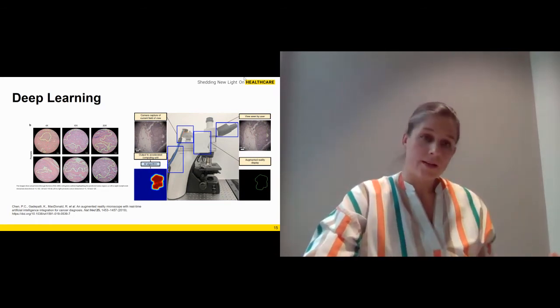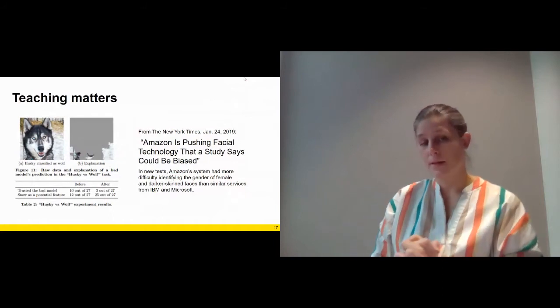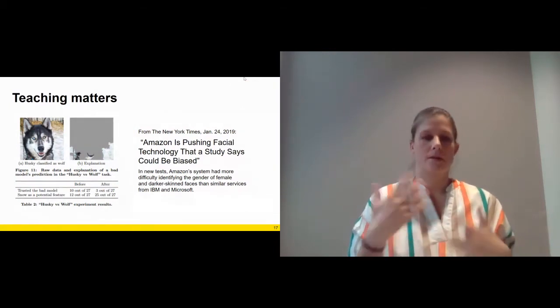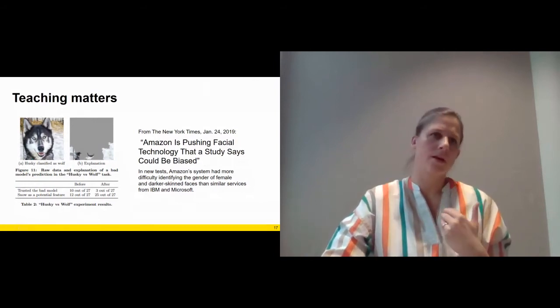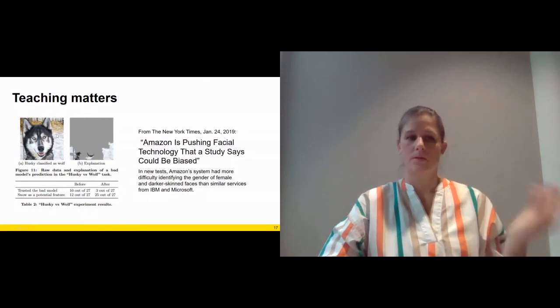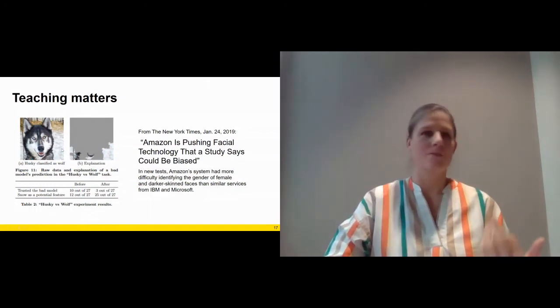As I said, if you want to have a good guidance, the data needs to be really thoroughly trained, and this is why teaching matters, and this is why we want to leave teaching in your hands. I want to explain this on a classical example where it failed. I mean, it's nice to identify images of cats or of dogs, but of course at some point you want to know which kind of dog. So this was a further step. And it happened that in this process, suddenly a lot of huskies got classified as wolves, which was very surprising, because you think of the husky, these typical eyes and the typical pattern they have in their face, for a human it's very easy to recognize. And analysis of this data actually showed that most pictures of wolves and huskies had snow in the back. So the algorithm took its decision not on the features we decide on, but on the snow in the back. And then it classified all animals with snow in the back, which were mainly huskies, as wolves.